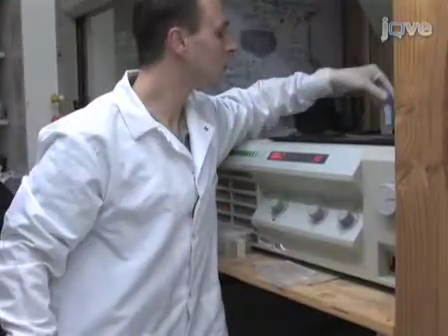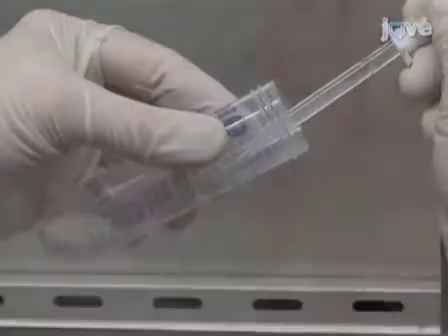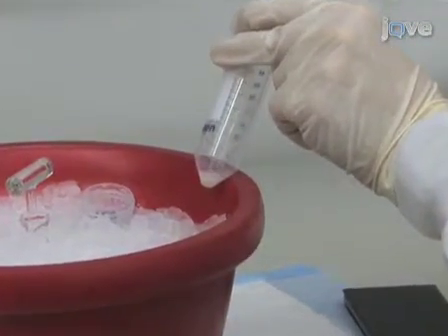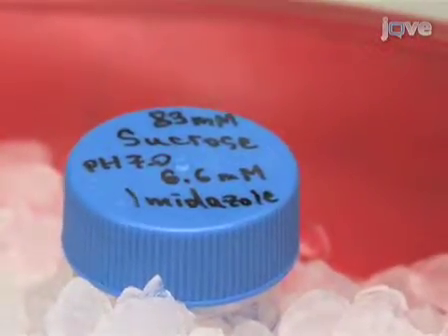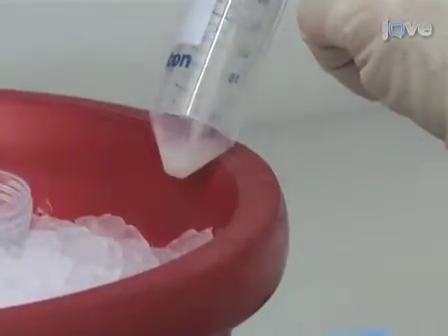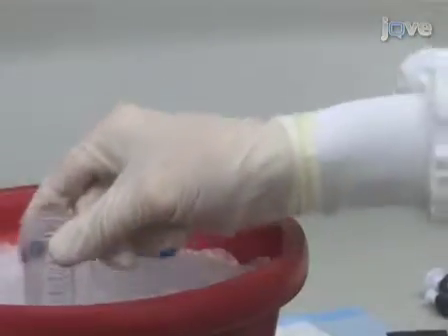The collected cells are then centrifuged at 200 times G for 5 minutes at room temperature. After spinning, discard the supernatant and resuspend the pelleted cells in 0.8 to 1.7 ml of ice-cold mitochondria isolation buffer with a freshly prepared cocktail of 1X protease inhibitor. How much buffer you use depends on the size of the cell pellet you get. After the pellet has been resuspended, incubate it on ice for about 10 minutes.